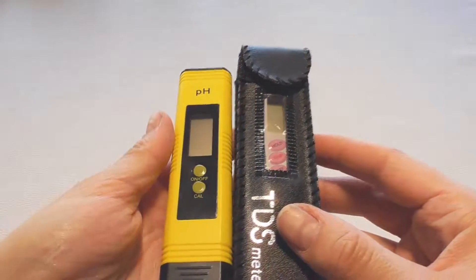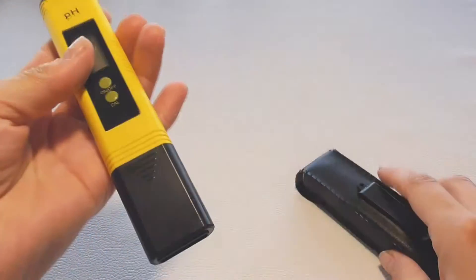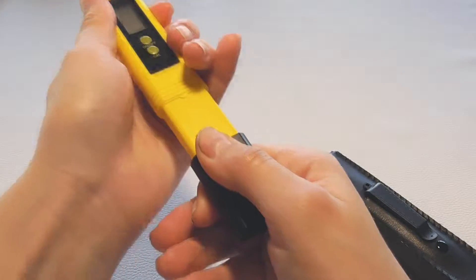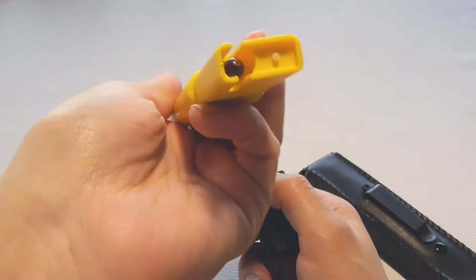These two are from AliExpress and they are portable pH and TDS meter testers measuring water quality. I ordered them in one set. This one is a pH tester.